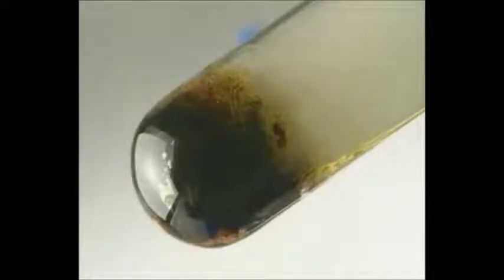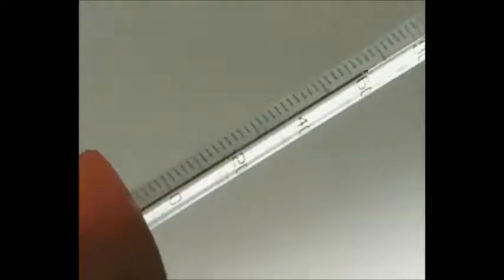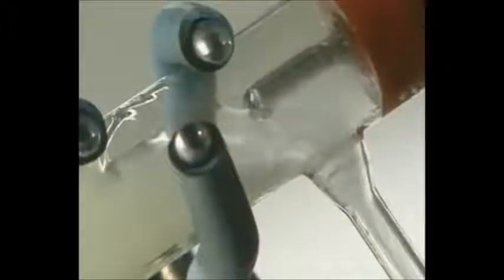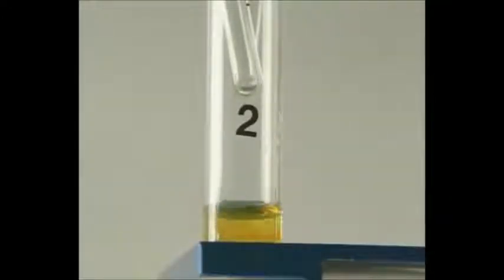Once the first fraction has been collected, it's safe to start heating with a Bunsen. As the temperature rises, other hydrocarbons begin to boil. A new fraction is collected at about 60 Celsius. It's slightly yellow in colour.